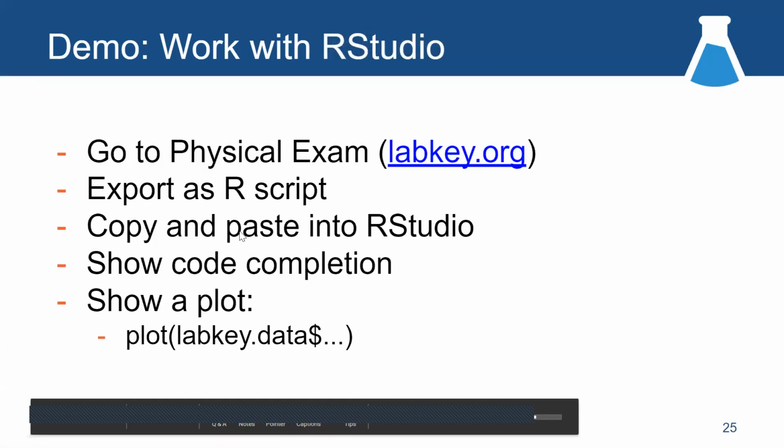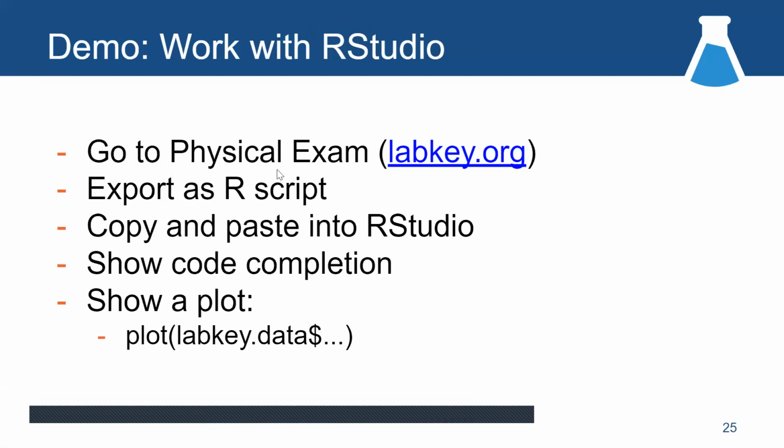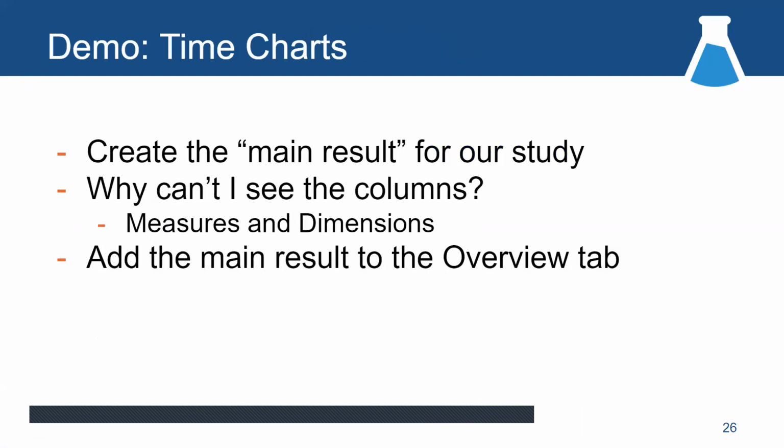You can also, by the way, do the same thing in RStudio. There's a way to point RStudio at a live server. I was hoping to demo that, but let's keep going. I think we're running out of time.